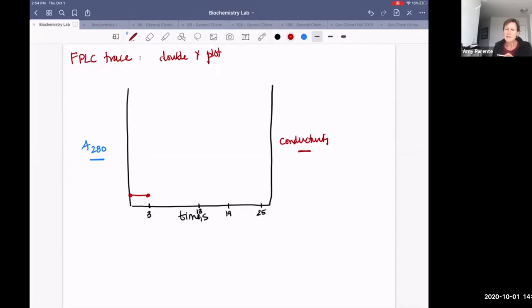And then what happened at 3 minutes? Well, I started adding in my buffer B, which was a salty solution. Now, I did it gradually over the next 10 minutes. I increased my saltiness gradually. Does that make sense to everybody? And then I changed again and I said, no more gradual.